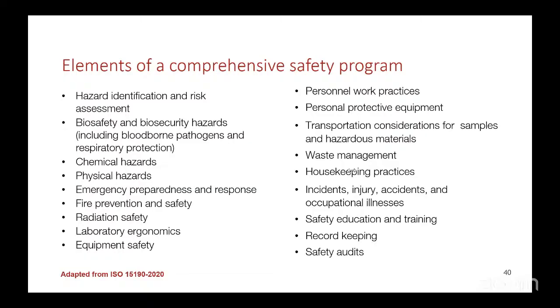Because for you to do an audit, you must be trained as a safety auditor, or an auditor that has knowledge in the areas of safety. If you do an audit and you have not been trained or deemed competent as an auditor, then it will not be valid; it's a non-conformity. A lot of facilities go for QMS implementation, and at the end of the day we see that audit and assessment is zero because they don't have an understanding that they have to do an audit.